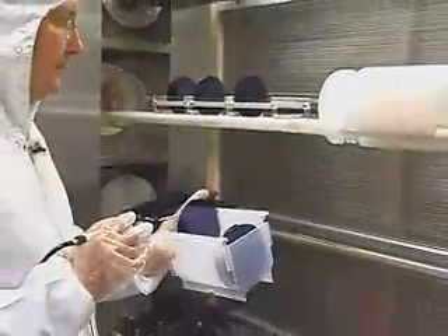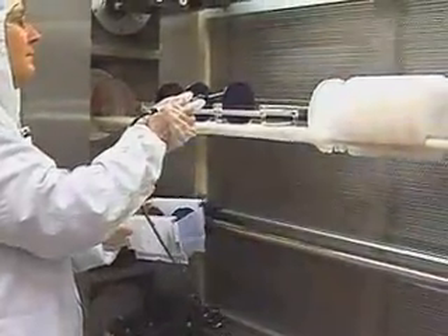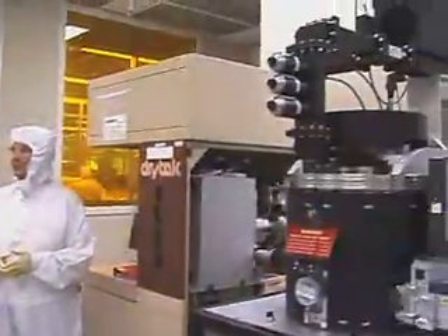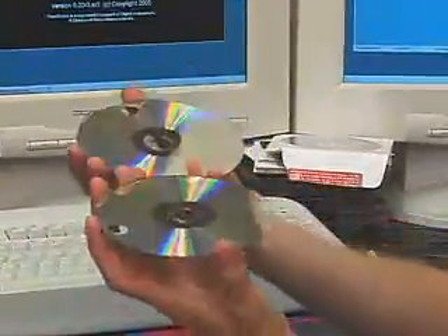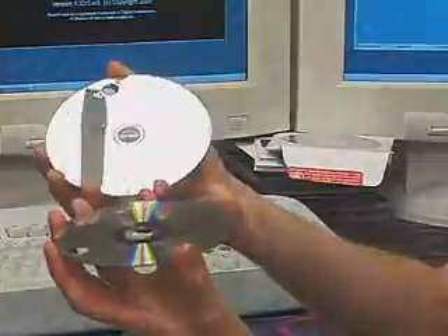Researchers around the world use an array of instruments to better understand natural and man-made materials that make up the nanoworld. Let's take a close-up glimpse into the nanoworld by imaging the surface of a DVD using an atomic force microscope.